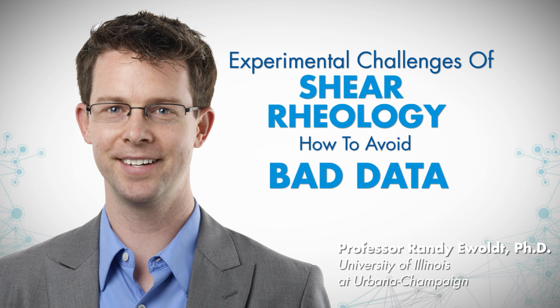Operator error. I would love to brainstorm the many different types of operator error that might cause this. There are things that TA Instruments has tried to address themselves, for example, the smart swap geometry, where they try to omit any possible errors of typing in the wrong geometry factors. So that's one thing that's been addressed by engineering the setup to automatically recognize what geometry is actually attached.